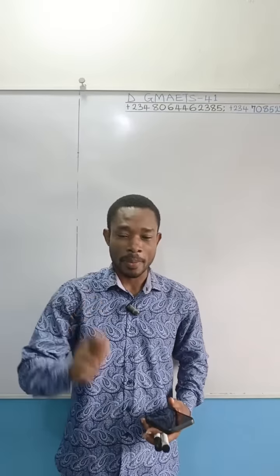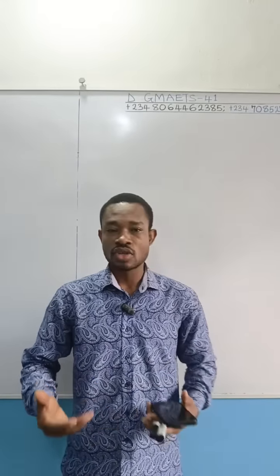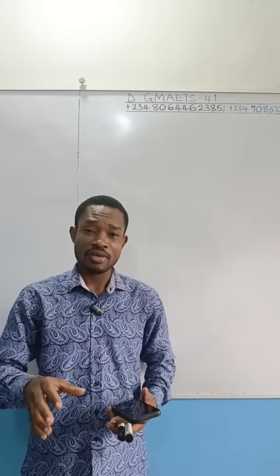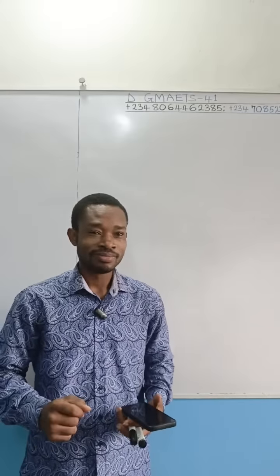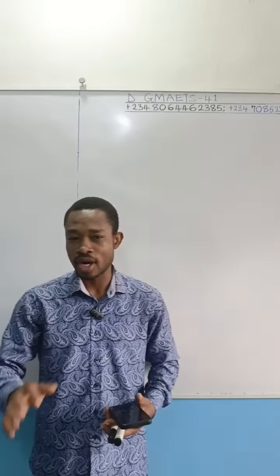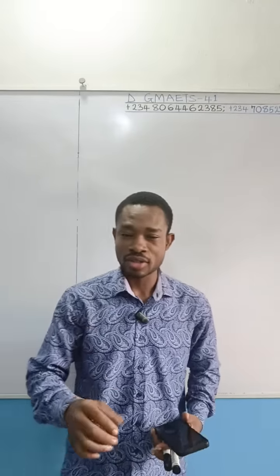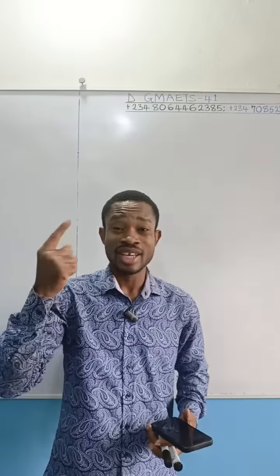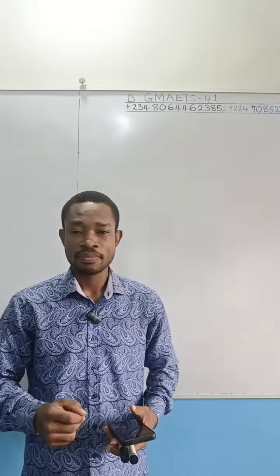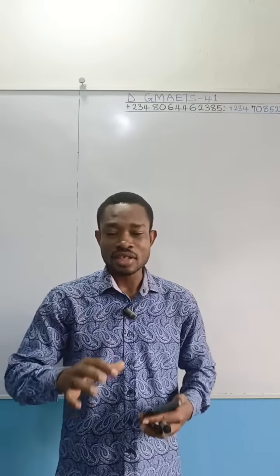First of all, when preparing for your Chem 107, chemistry practicals generally have almost the same principle that guides them. There are various areas you want to prepare for because your examiner does not respect any batch. You enter the exam hall, you are given your question paper, and whatever you see, you answer. You'll be tested on titration, volumetric analysis, and on qualitative analysis, that is salt analysis. So the first thing is for you to remember the necessary principles guiding this.